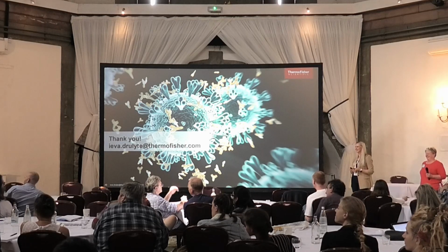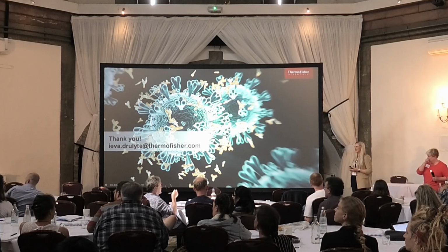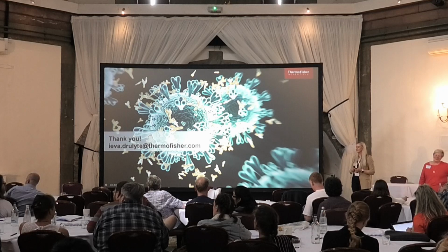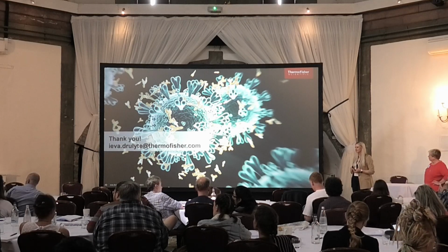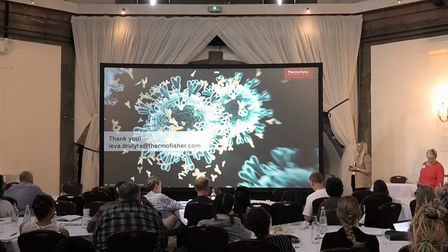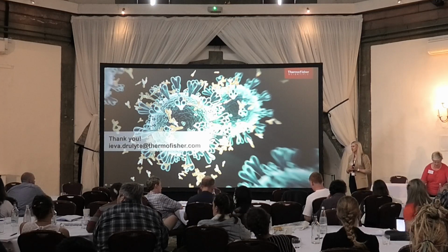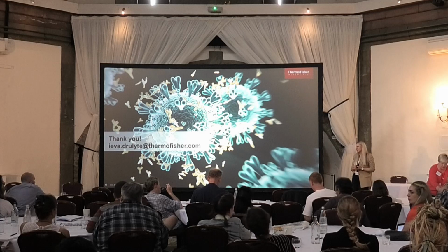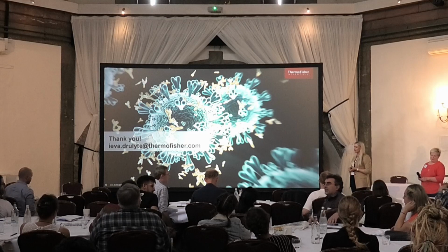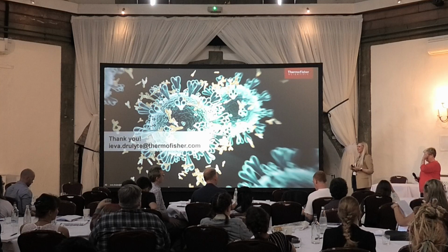I was wondering how you are progressing in automatic feature identification for segmentation, and how you can identify specific objects within your images, because you get a lot of interesting images, but to know what is what, how is the software progressing? Yeah, let's take it over coffee, but I can tell you a bit more about Amira. Are you using Amira? Yeah, in our Amira, the team is actually working on using AI/ML to identify features and make segmentation much easier. We can chat about it more.